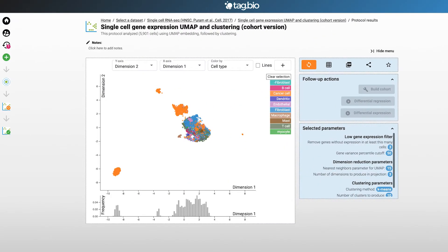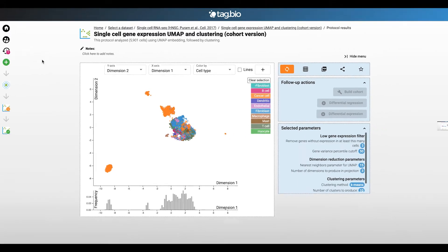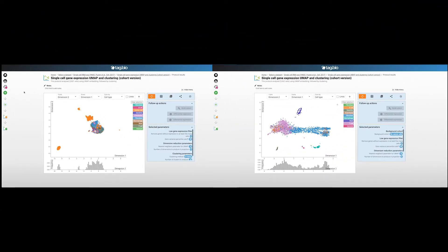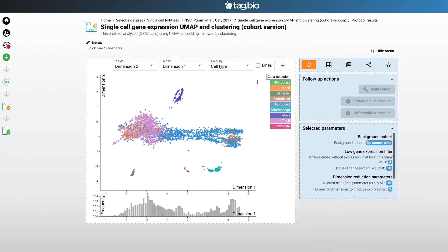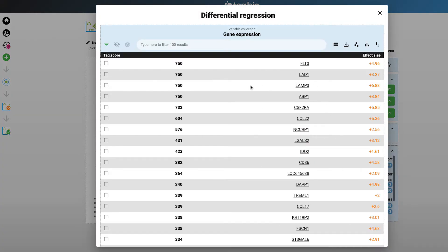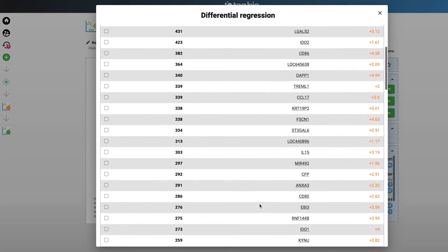So to recap, this demo is to show how the single gene expression analysis app works. We ran two analyses with two different cohorts and then ran a differential regression on one of the cell types to get a list of genes that govern important functions for that cell type.